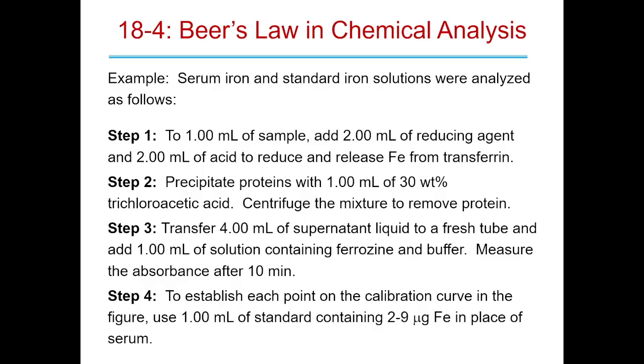For example, let's think of this case. We're fitting a Beer's law curve, right? So we plot our absorbance versus our concentrations. Let's say I get points, point, point. Looks like a beautiful curve, right? Nice and linear. Let's say I start going like this though. Ding, ding, ding. Uh-oh. I got into my dynamic region now, and I'm past my dynamic region here, aren't I? Remember that? There's a linear region.